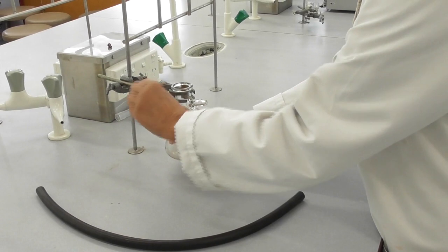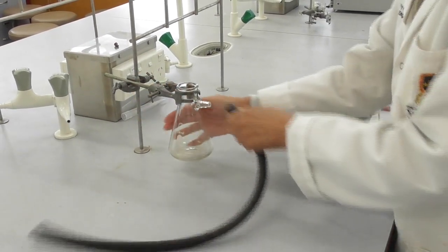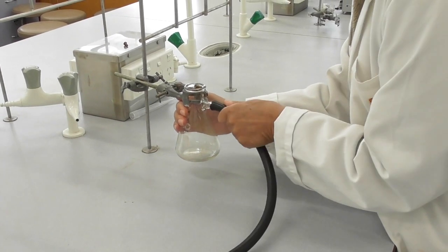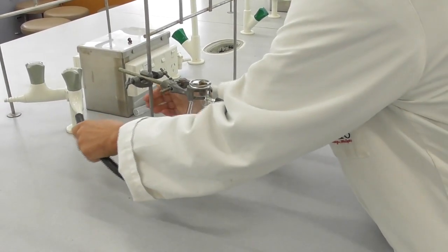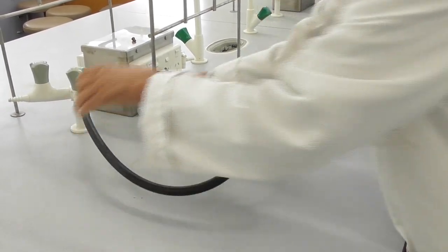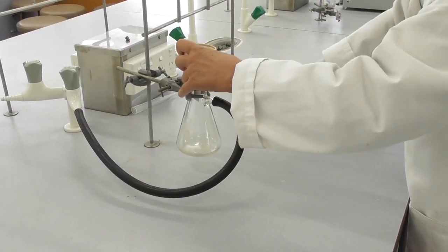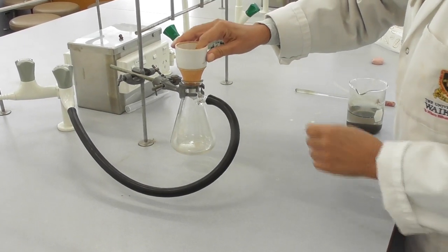The next step is to set up the vacuum filtration. I clamp my vacuum flask, attach the vacuum hose, attach the other end to the vacuum outlet. I take my Büchner funnel, put it on top of the flask and add my filter paper.